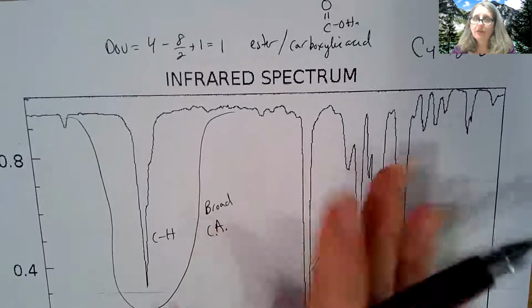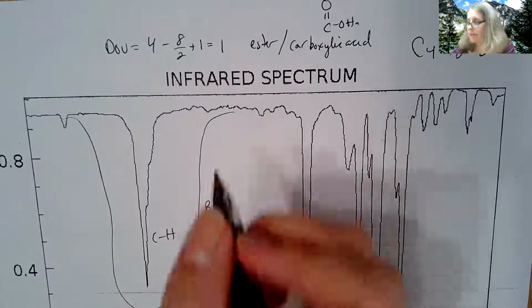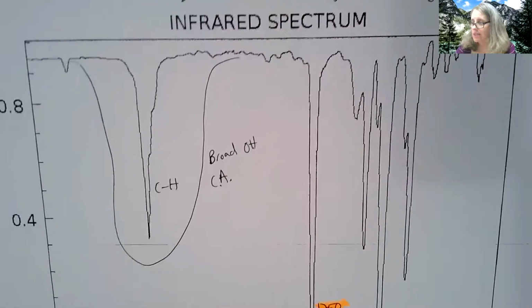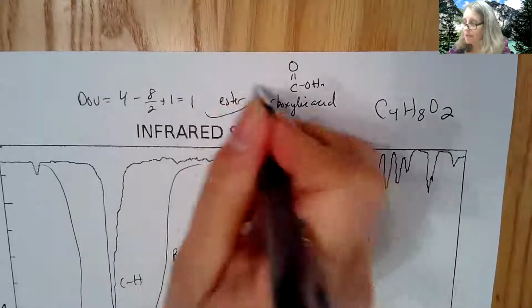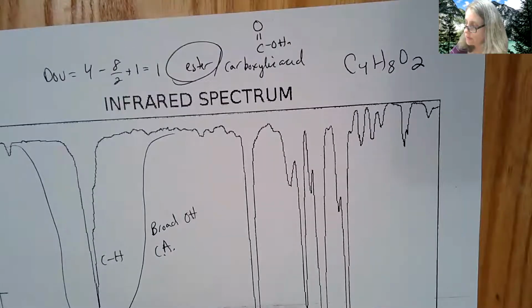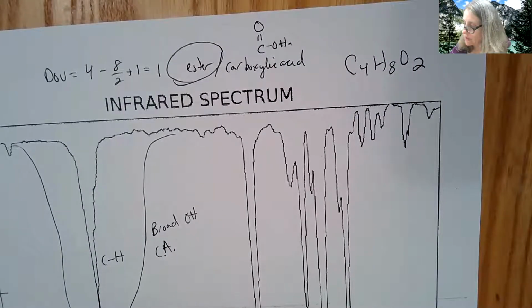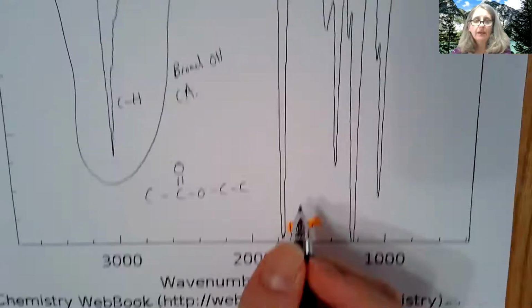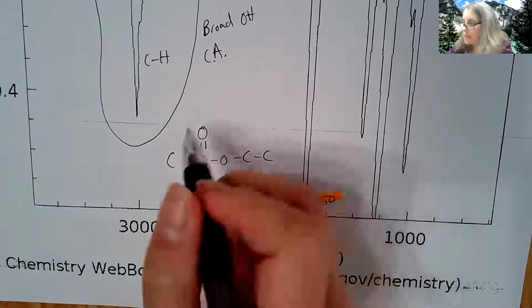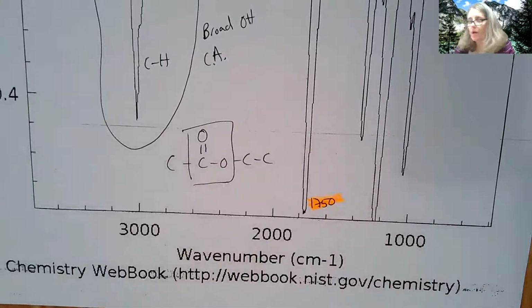It's very unique for carboxylic acids because that OH essentially is kind of intertwined with some other things in there. So then I have to have some kind of ester here. So all I would want you to do is to draw a proper ester. And again, how many carbons I have on either side is going to be figured out later. But as long as I have an ester group drawn with the correct number of carbons, that is what I'm looking at for this activity.